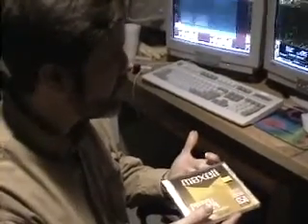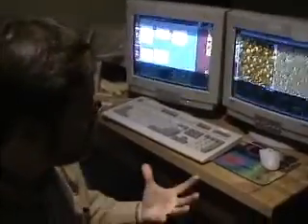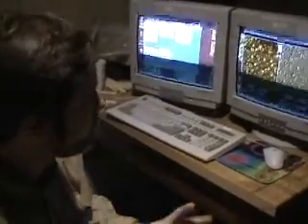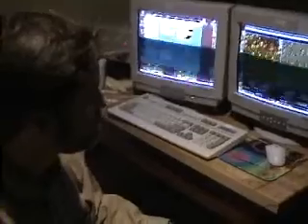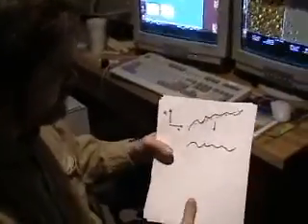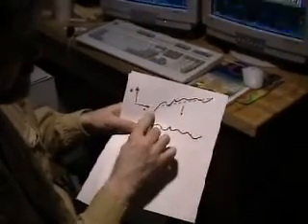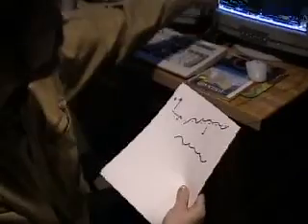When it's accumulating the data, it has no way of knowing what the entire plane worth of data is. And yet it's very useful for us to be able to see this image live as it's being accumulated, because much of the time you don't want to wait for the whole image to accumulate before you zoom in on some feature of interest. And so in the line plane fit option, which is what it's set to now, it accumulates one line of data as shown here in cross section. I'm plotting Z on the vertical axis, X on the horizontal axis, and this might be one line of data taken across here.